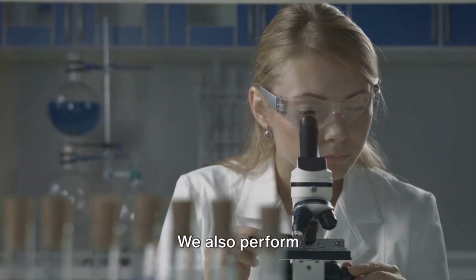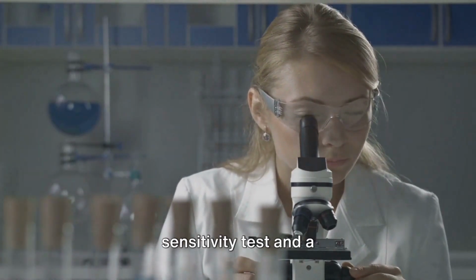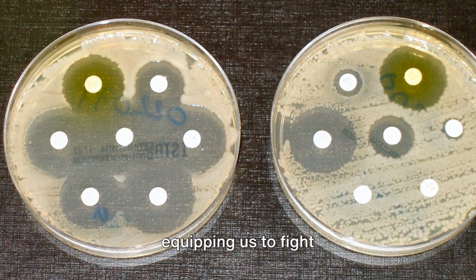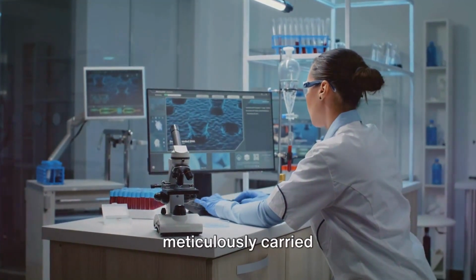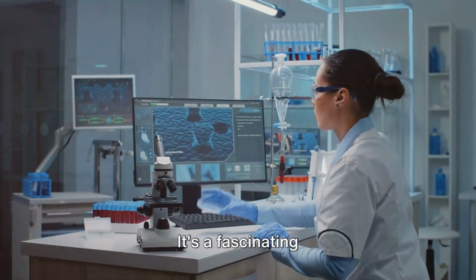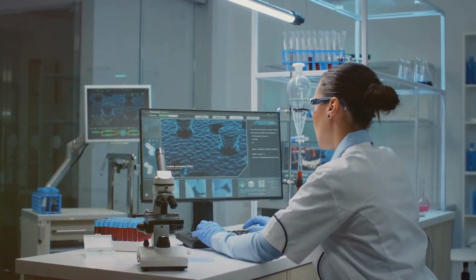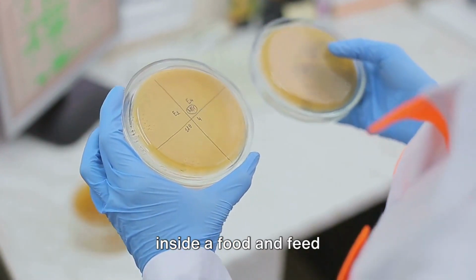Our journey doesn't end there. We also perform microscopic identification of molds, an antibiotic sensitivity test, and a minimum inhibitory concentration test. These tests help us understand the microbial world better, equipping us to fight against harmful microbes and utilize beneficial ones. Each step is meticulously carried out to ensure the highest level of food and feed safety. It's a fascinating journey through a world invisible to the naked eye, but of immense significance to our health and well-being. Let's recap the journey we've taken inside a food and feed microbiology lab.